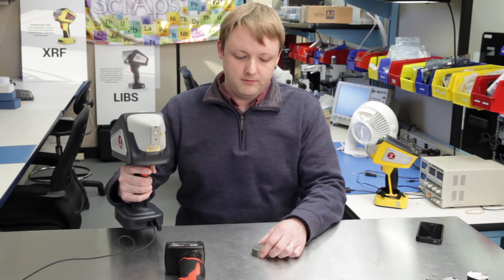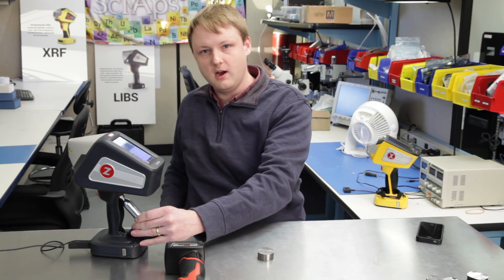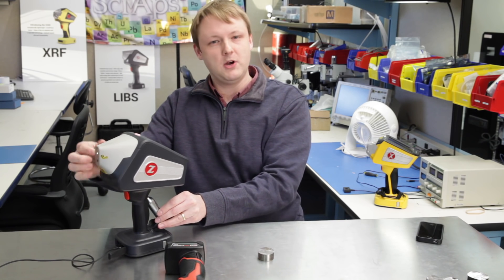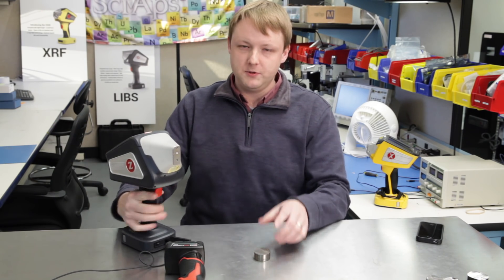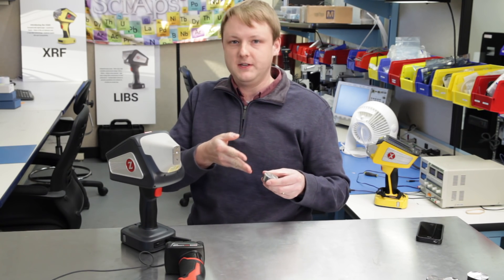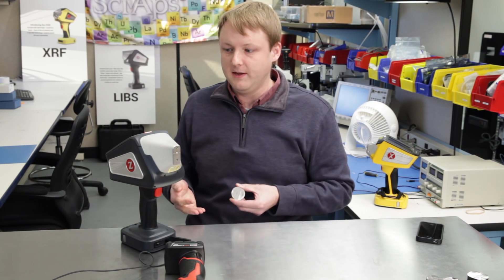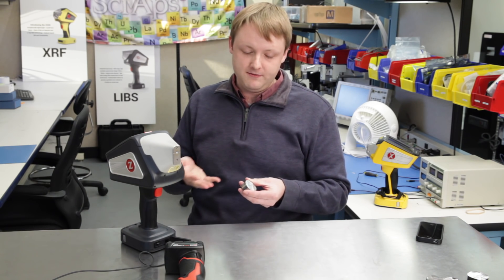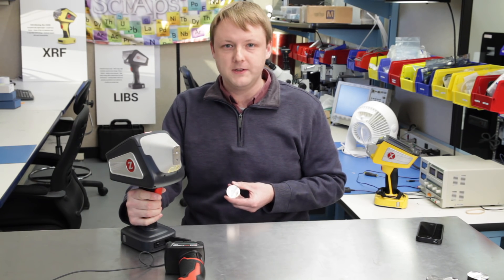We have a little argon cartridge in the handle of the analyzer, and it just purges the nose area right where the laser spark happens, right where the sample is. LIBS uses a laser to vaporize a small amount of the sample, produce a plasma, and look at the emission from the elements that are in the plasma. Because we're using a laser, we can also use that to clean the sample, to get rid of some small amount of surface contamination on the alloys that you're testing.